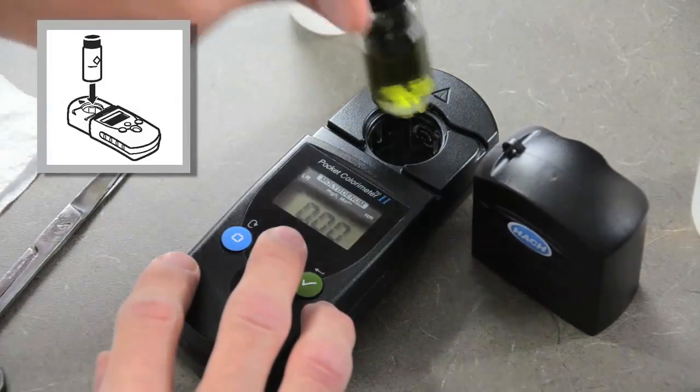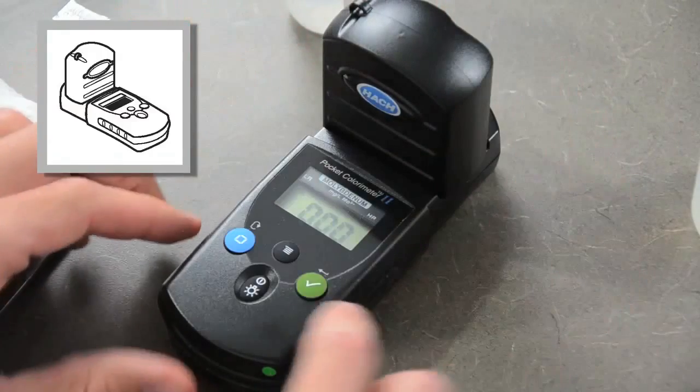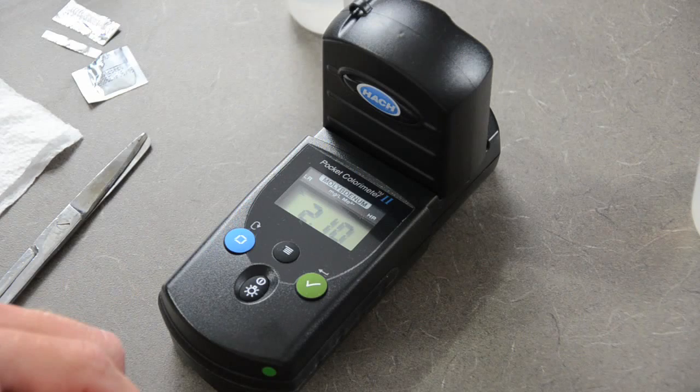Place the prepared sample in the cell holder. Cover the sample cell with the instrument cap and press the read/enter button. This sample reads at 2.10 parts per million.